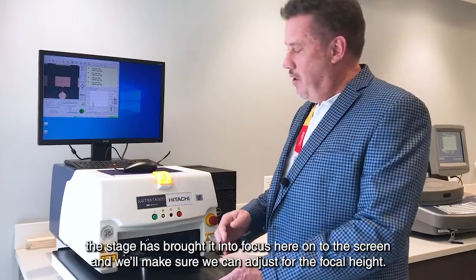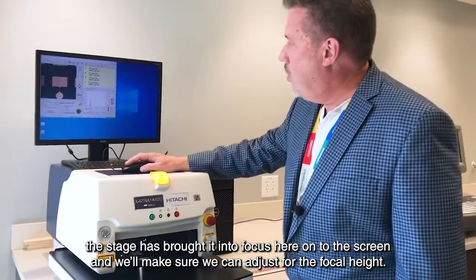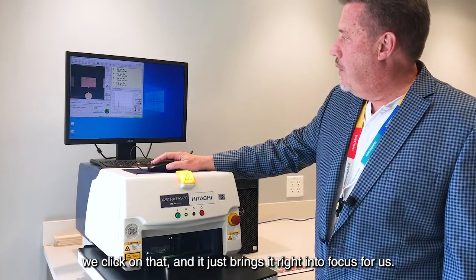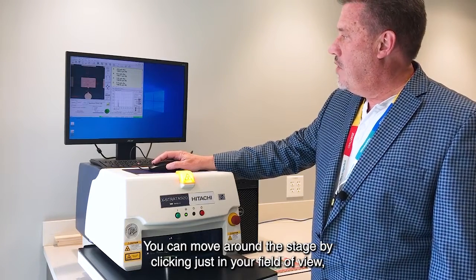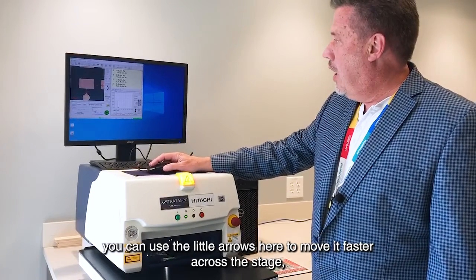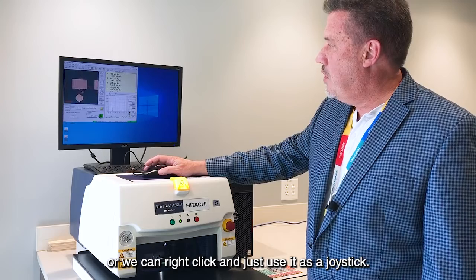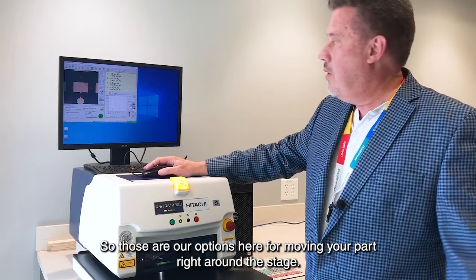Now that we've put our part in, the stage has brought it into focus here on the screen. We want to make sure we can adjust for the focal height, so here we have a focus laser. You can see the little red dot — click on that and it brings it right into focus. You can move around the stage by clicking in your field of view, use the arrows to move faster, or right-click and use it as a joystick.